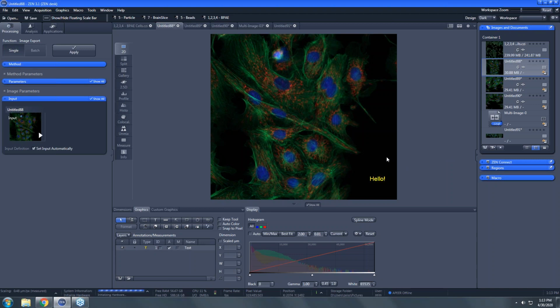So let's go from an annotation, a text annotation, to a measurement, Nicole. So we'll do a square tool or a circle or any sort of other measurement tool that's in the graphics quick box there. Sure. Let's draw that somewhere on the image. So you can do the same modification of your text, your font size, etc. on this, but you can also change the measurement features.